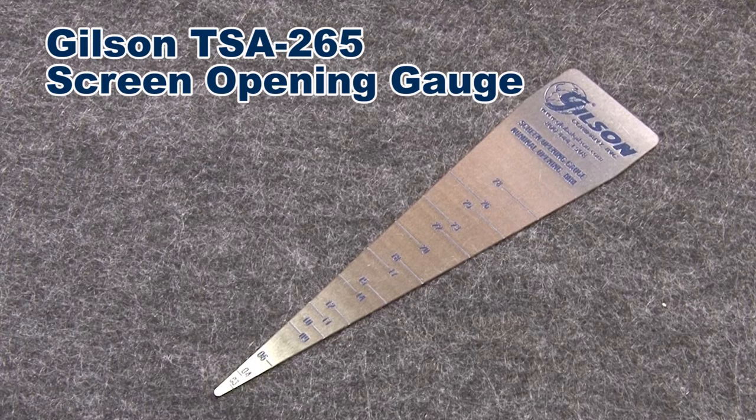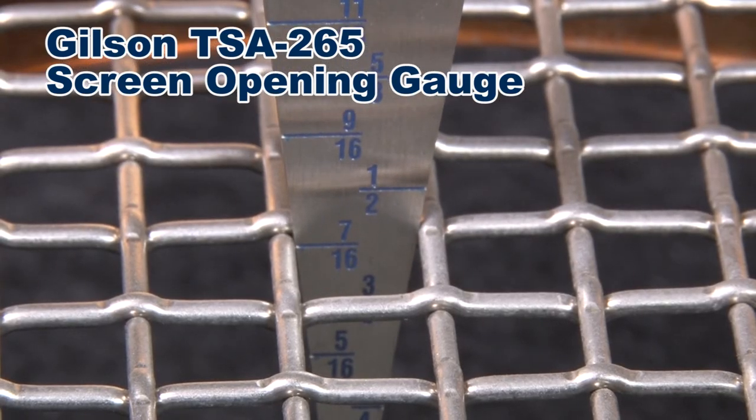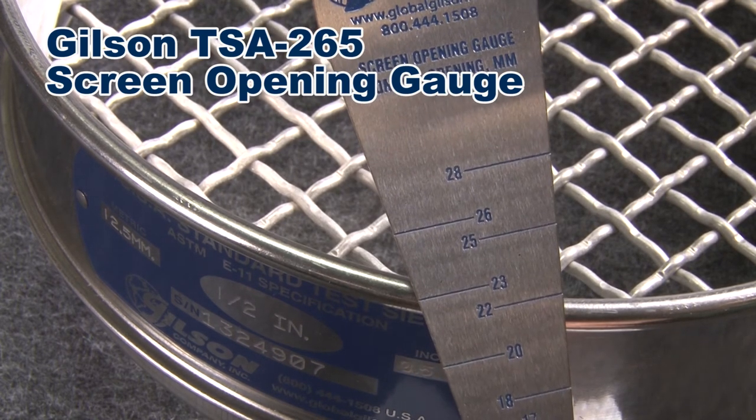The Gilson screen opening gauge is used as a quick-check tool for determining wire cloth opening sizes. The user simply places the gauge in an opening and reads where the mesh contacts the sides of the gauge. The durable 22-gauge stainless steel body has marked graduations in inches on one side and millimeters on the other.